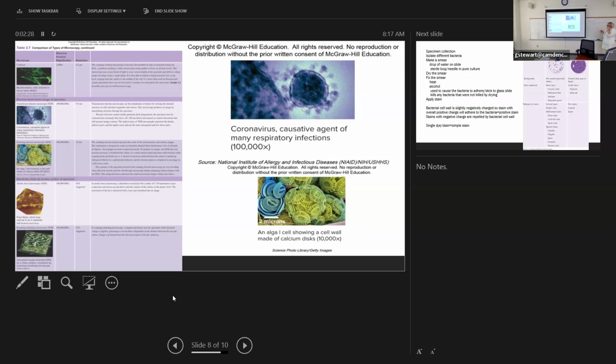And that's going to be fed through some sort of a computer. The microscope is going to be attached to the computer, and you're going to actually be able to manipulate the image a little bit more to expand certain areas of the image. And you can also take video off of the image. So this is primarily used to visualize cellular physiology.